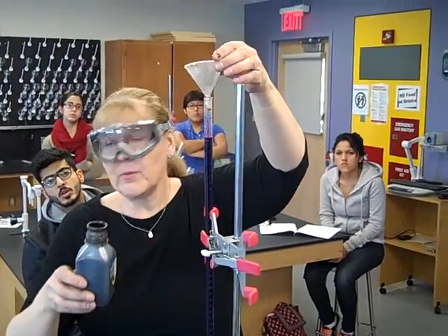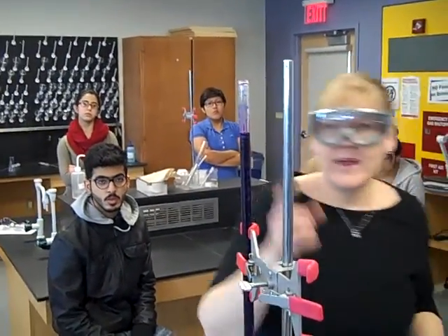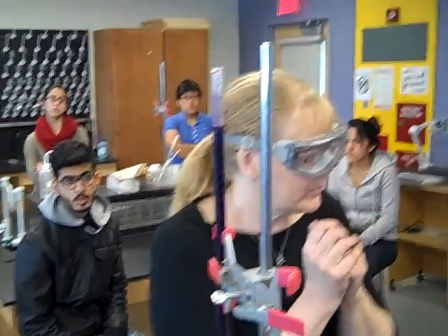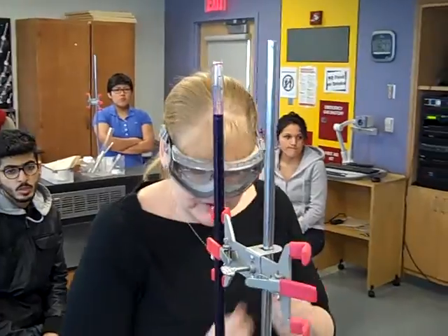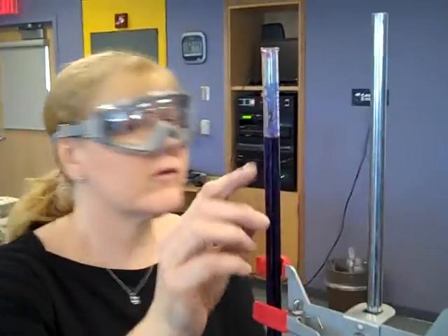I know this is a lovely shade of purple — it will turn everything you own brown. If you get this on your clothes, you will get brown spots. Get it on your hands, you will get brown spots. It is a powerful oxidizer. So I'm going to make sure that there's no air bubbles in the tip, and I want my burette to be starting at zero.